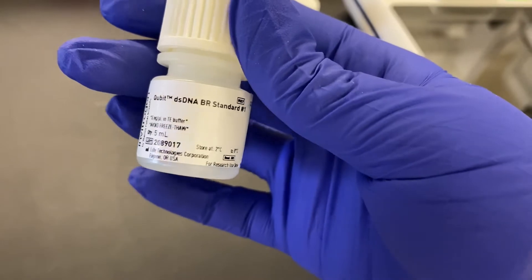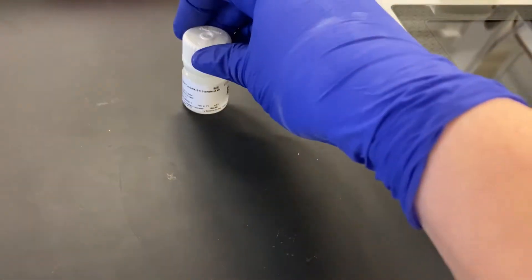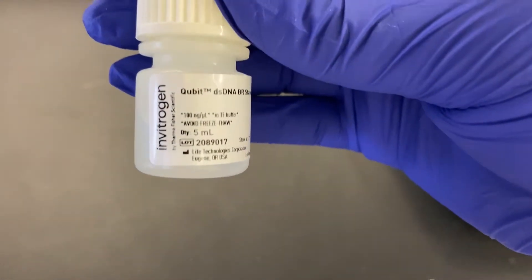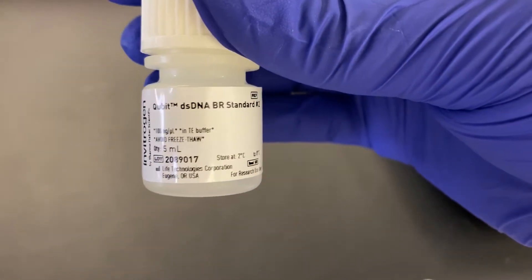Before going forward with the assay on all of my samples I always check the standards first. That way if something is wrong with the working solution I know before using up valuable samples and time.